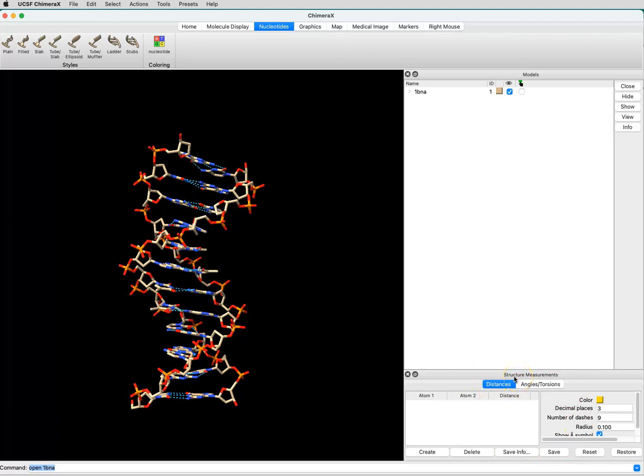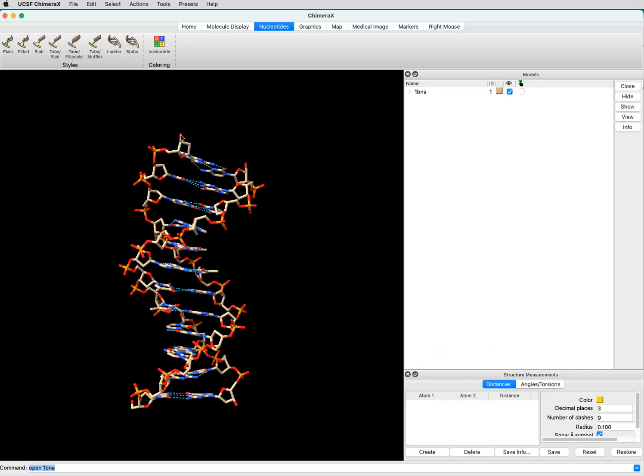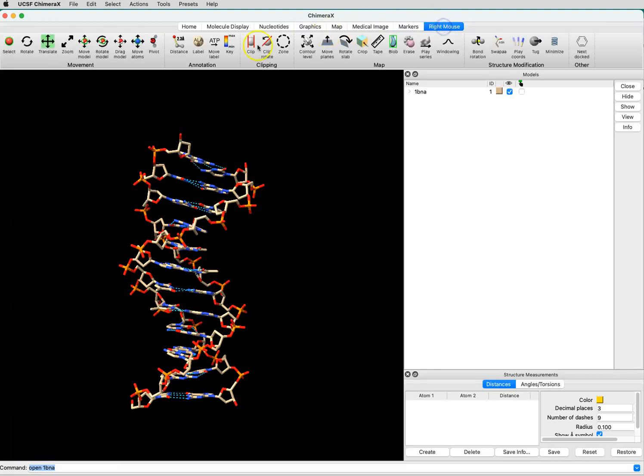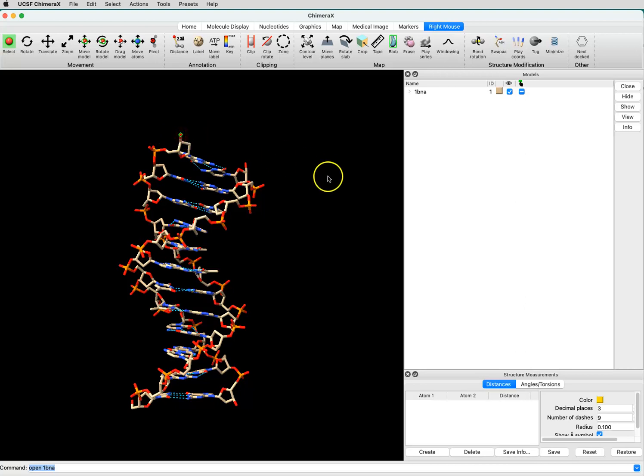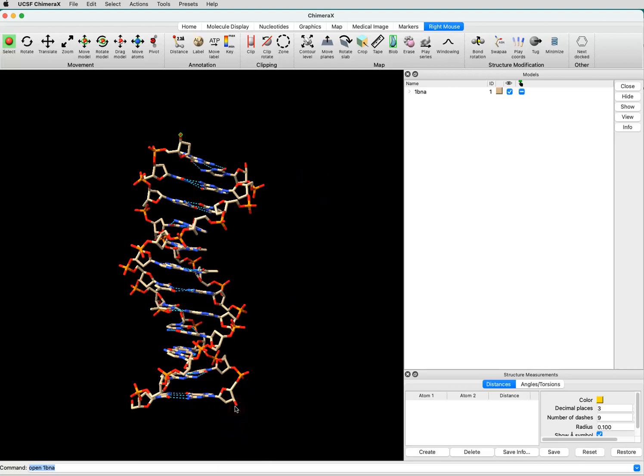Let's say I wanted to measure the length of this helix. I would select an atom at the top. So I'm going to change my right mouse click to be Select. I'm going to click on one atom at the top.